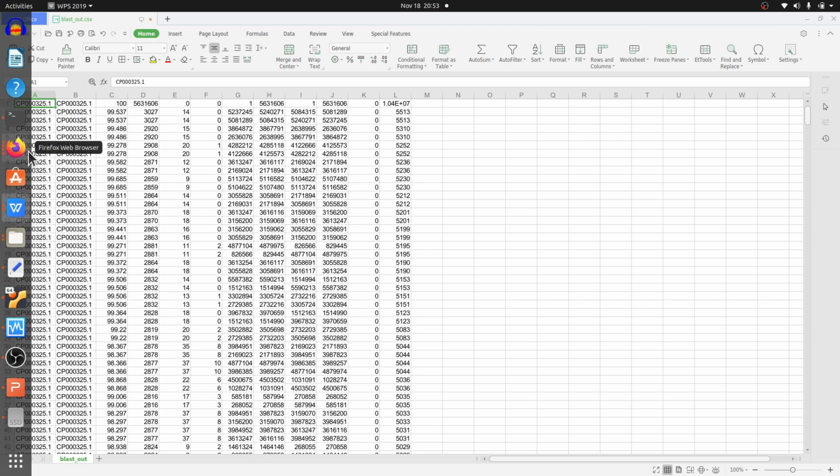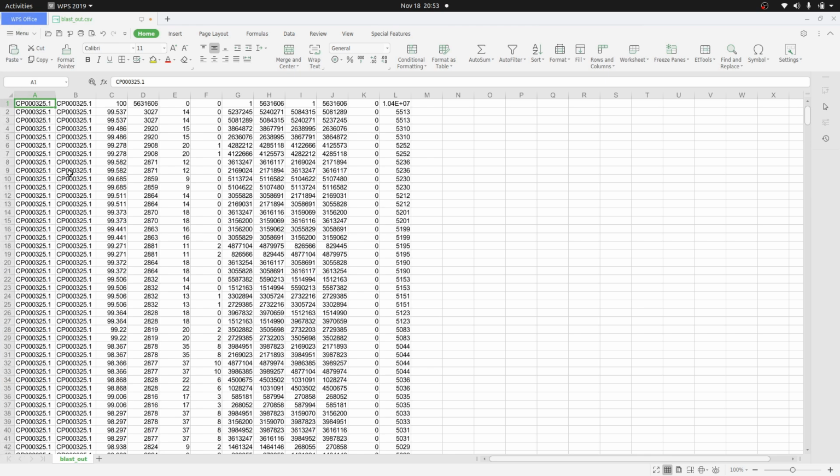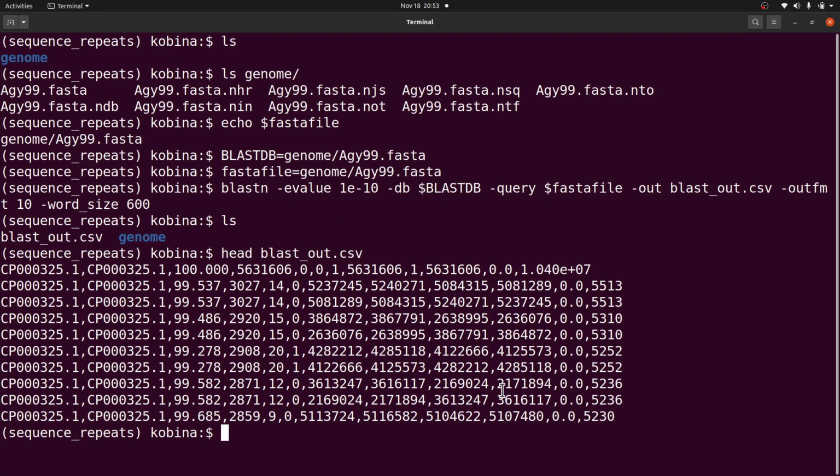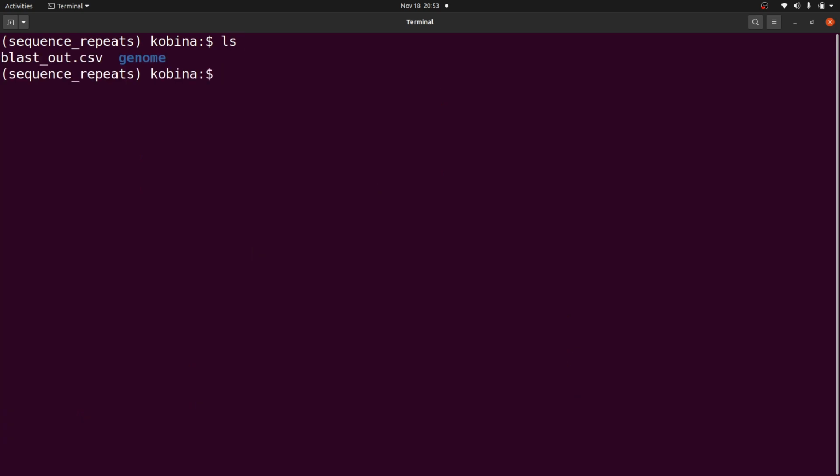I'll explain a couple of things, but for now I want us to extract the needed information and then we can proceed. So let's get back to the terminal and do this. If you have a CSV file like this, you can easily extract the information from it using the awk tool in Bash on Linux. So that's what we are going to use. Let's clear the screen, run ls, and proceed. We are going to extract some information from it, so we will use awk.